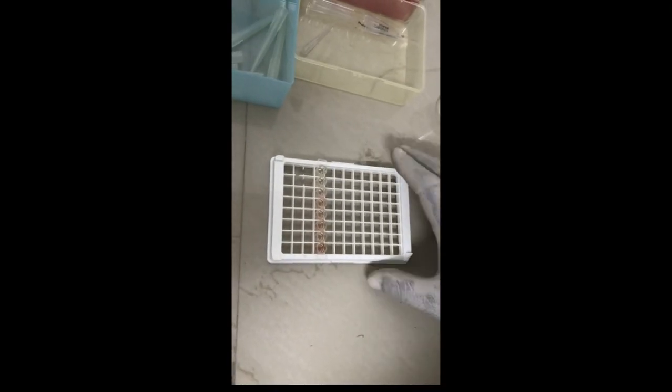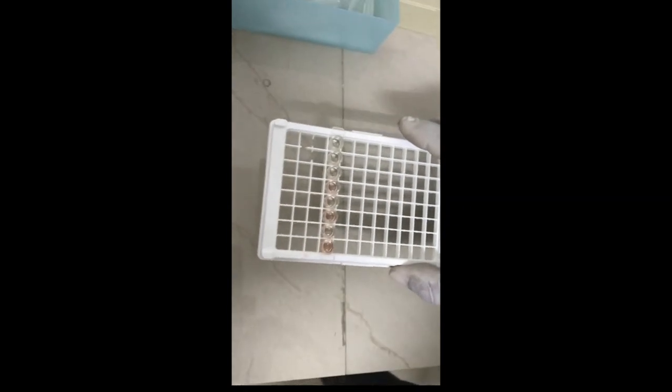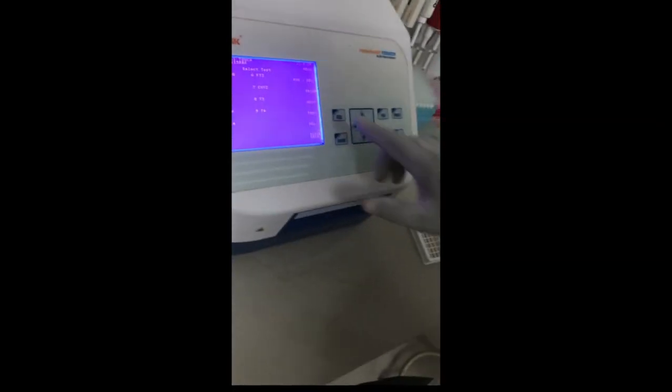After 15 minutes, we have taken out the strips and now we are going to read it in the ELISA reader. We will put it into the reader for the readings to come. We will set the reader according to the protocol and take out the readings.